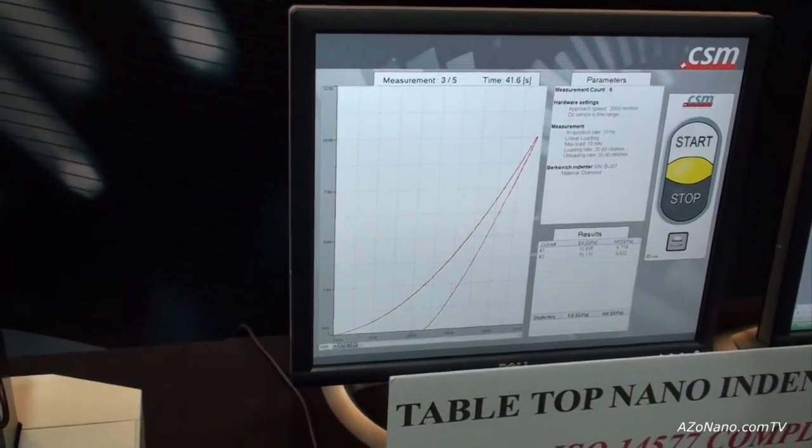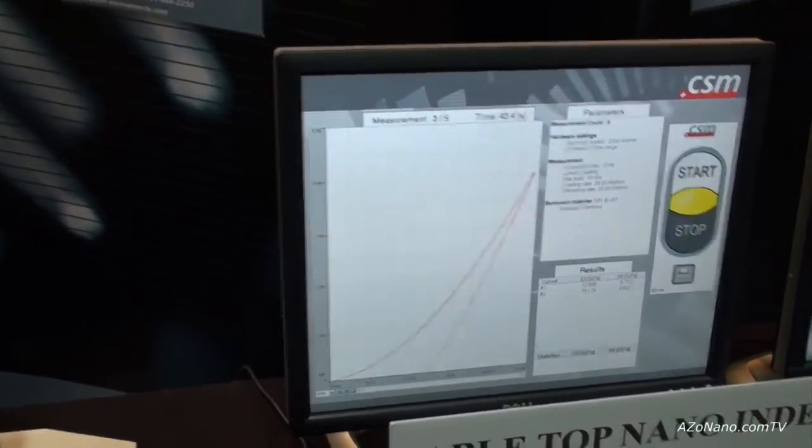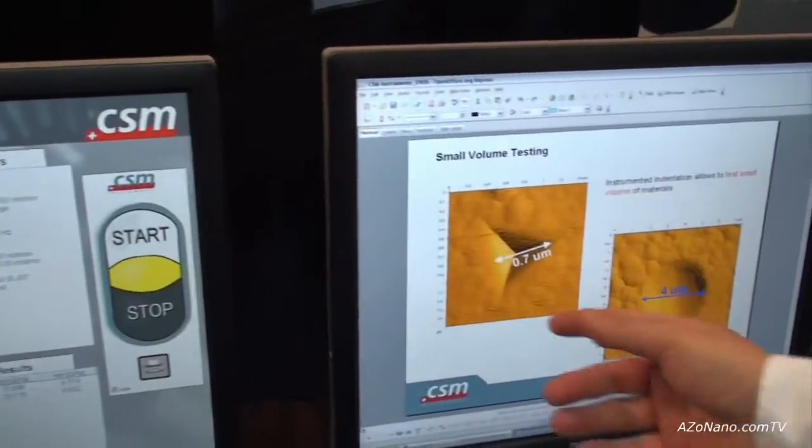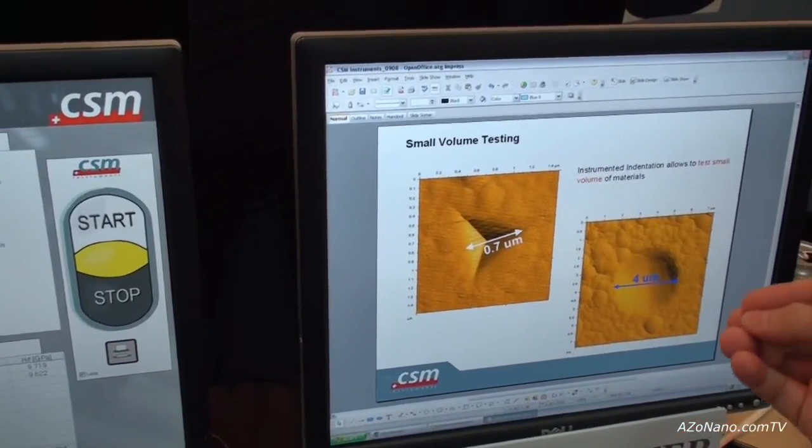The curve that you get can also be correlated with what you see under the microscope. So, if you're looking at the indentation, you can also take microscopic observations.